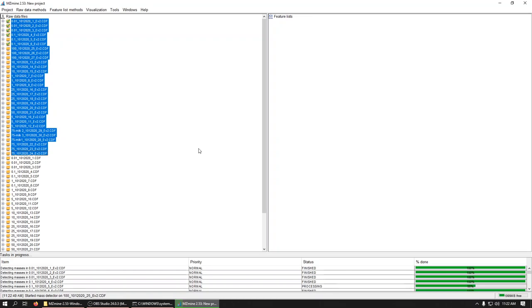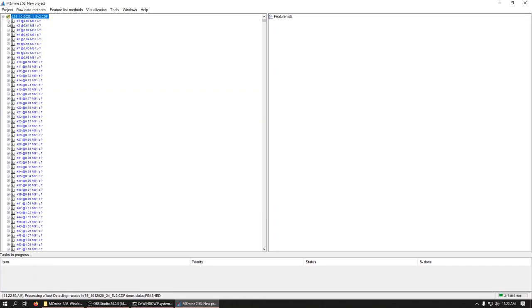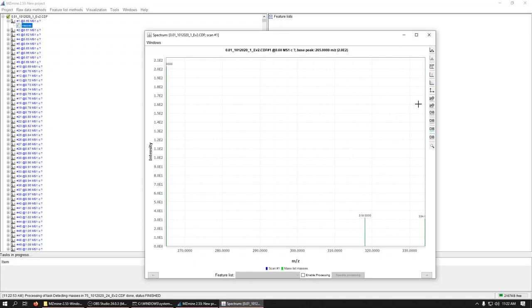And it chews. And we'll see little green check marks appear as it finishes. Because that now means under each scan, it's got a list of masses. Yay!